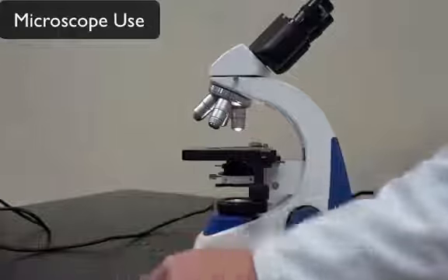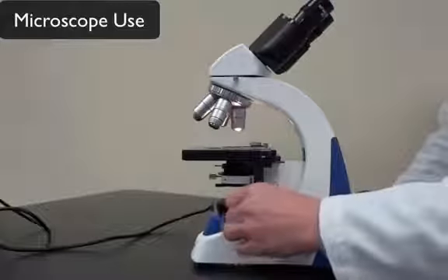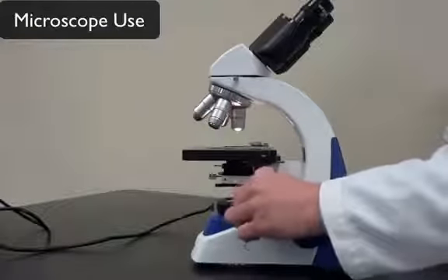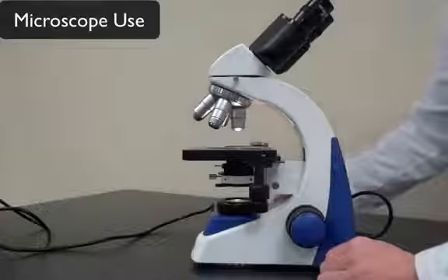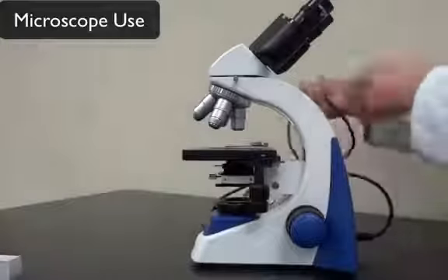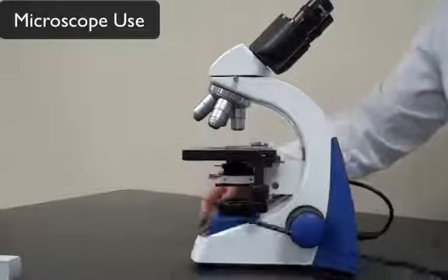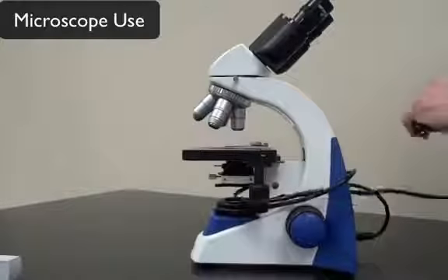If you're all done with the lab, what you want to do is center up the stage clip so the arm of the stage clip is not protruding out very far. You want to slowly turn off your light source, and then unplug your microscope and gently wrap the cord around the lower part of the base and the arm section, just like this.